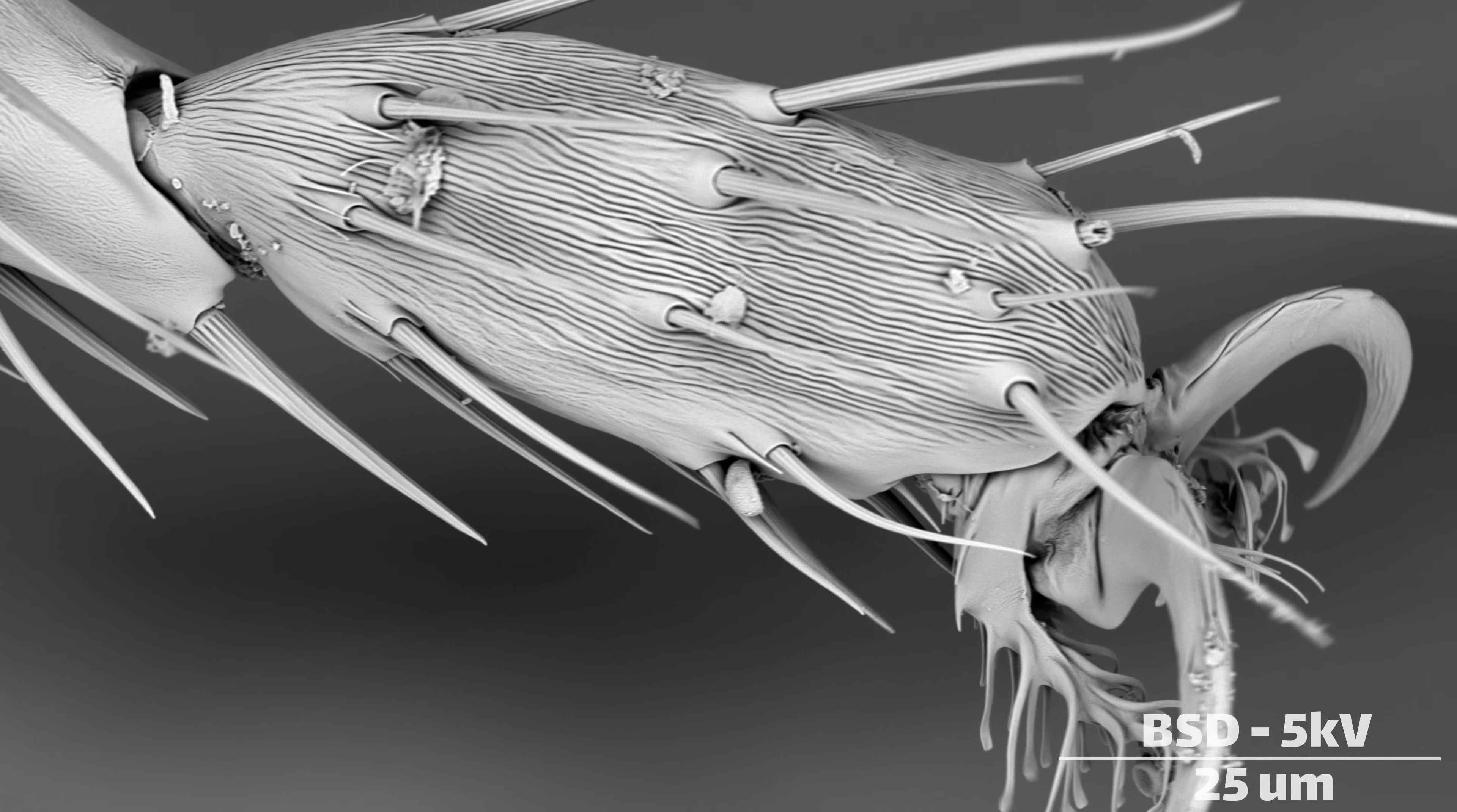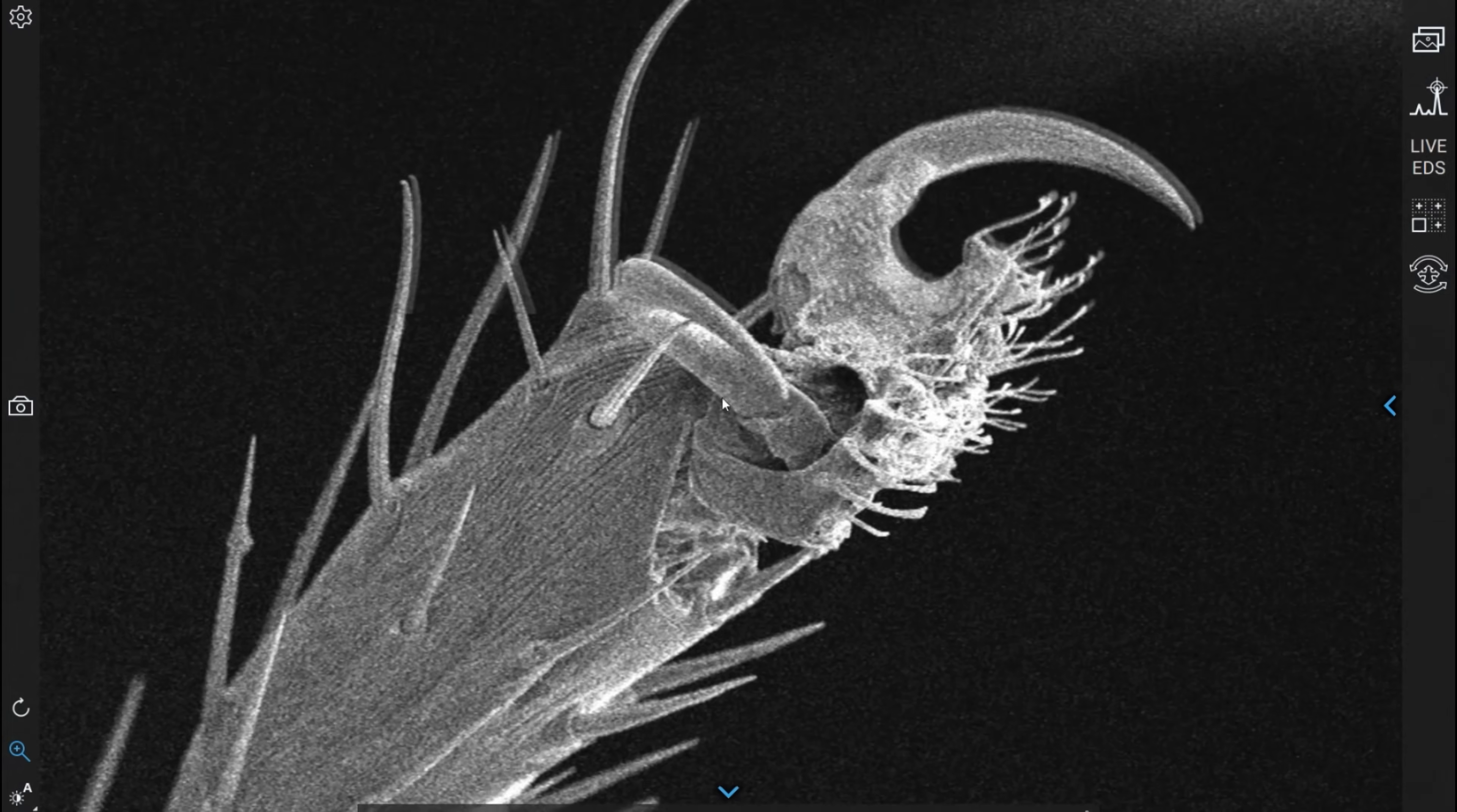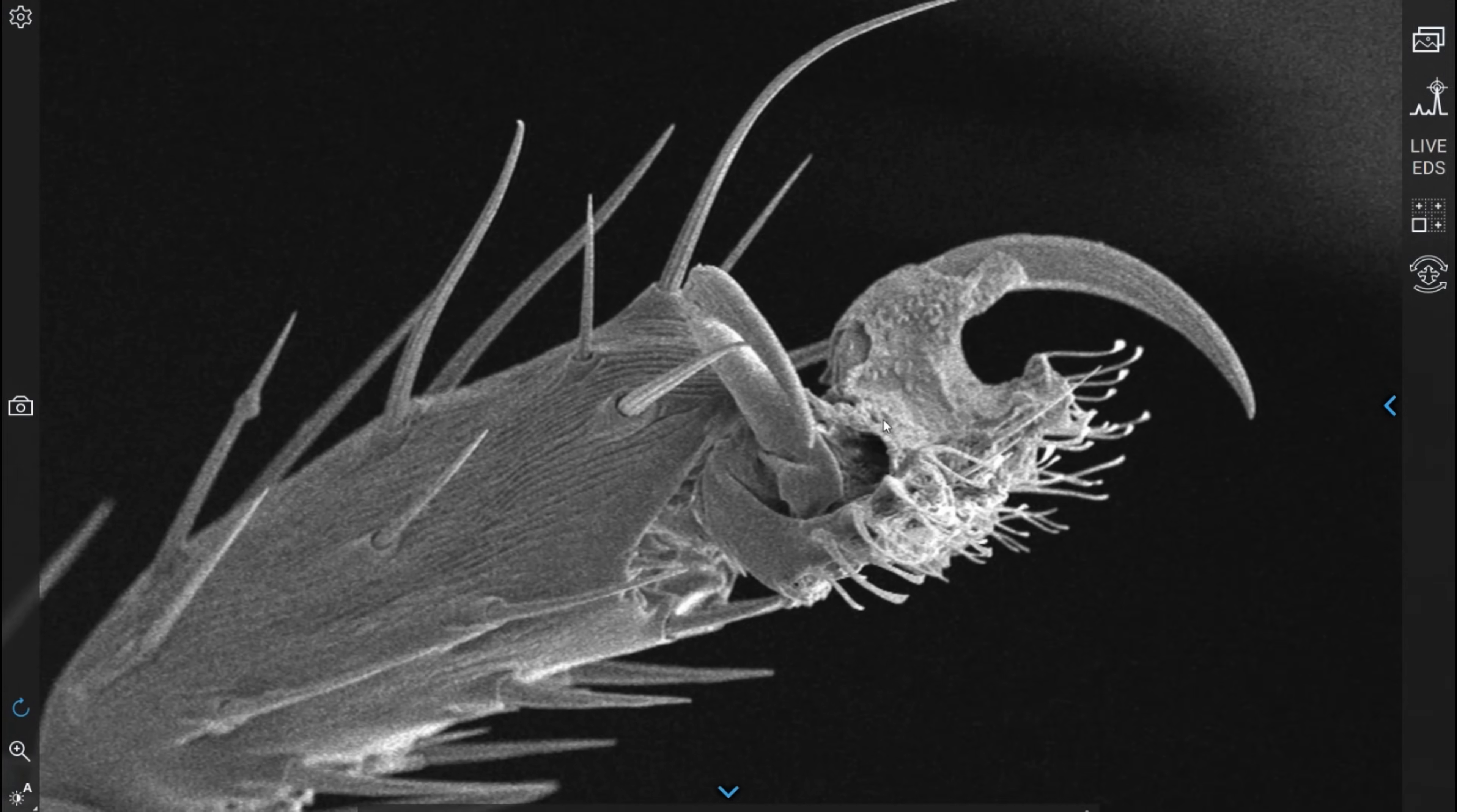Drosophila feet are composed of two to three curved claws, and these claws are used to climb relatively rough surfaces, like the side of a piece of fruit. In between the claws are pads known as pulvilli. And these pulvilli pads sprout tubular fronds known as setae, which are used to help climb smooth surfaces like glass.